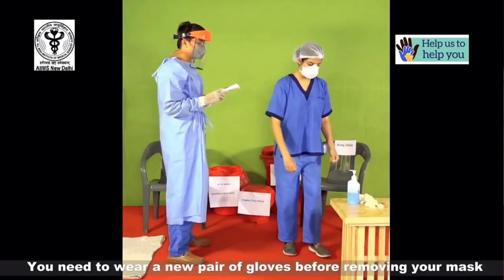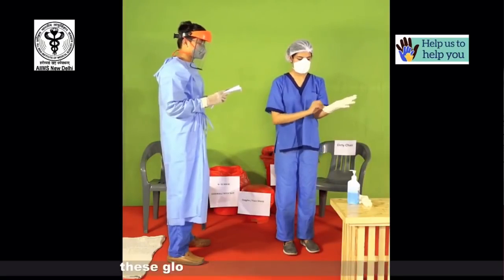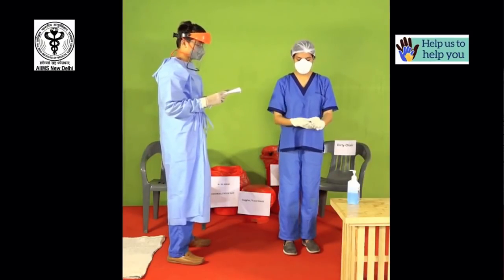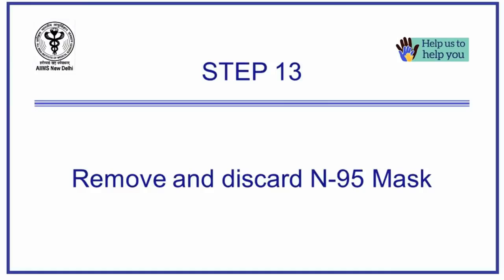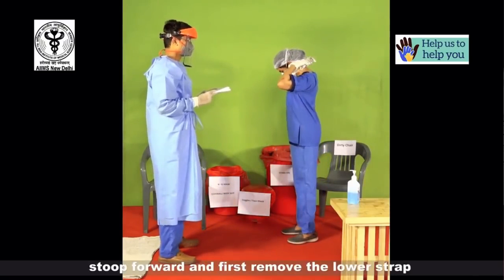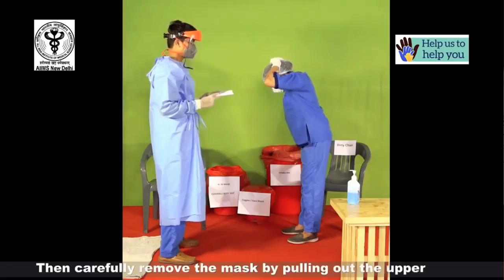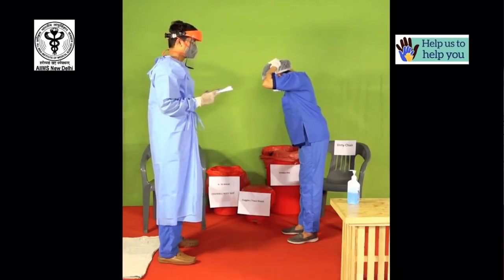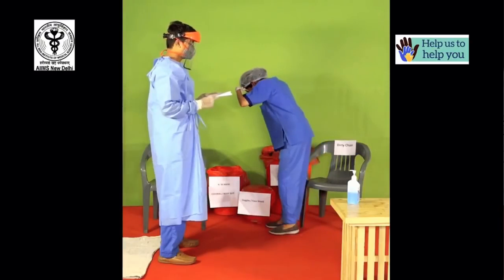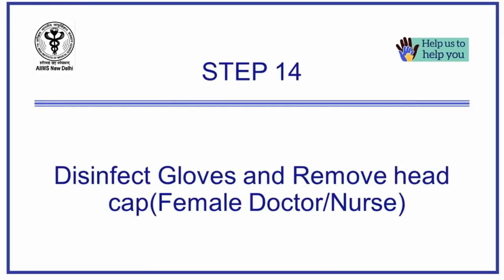You need to wear a new pair of gloves before removing your mask. These gloves may be sterile or unsterile. Do not touch the exposed surface of the mask. Stoop forward and first remove the lower strap. Then carefully remove the mask by pulling out the upper strap. Disinfect your gloves.